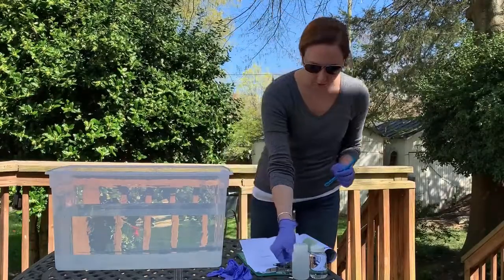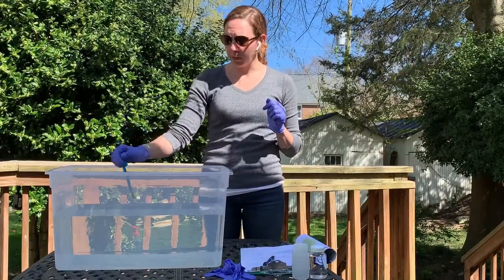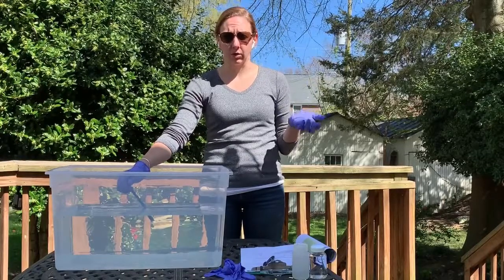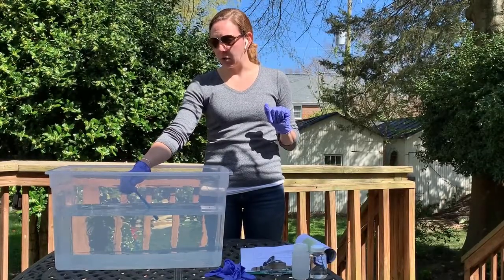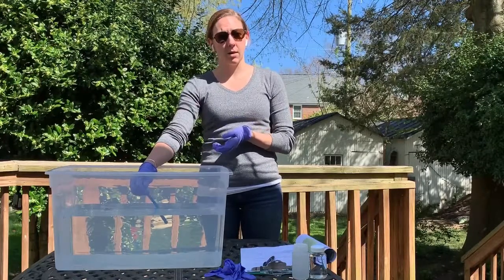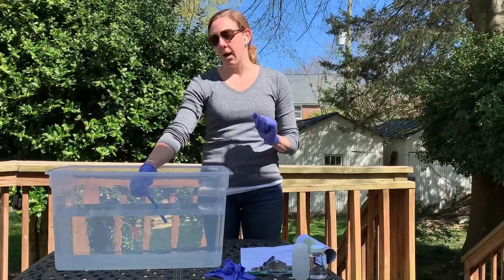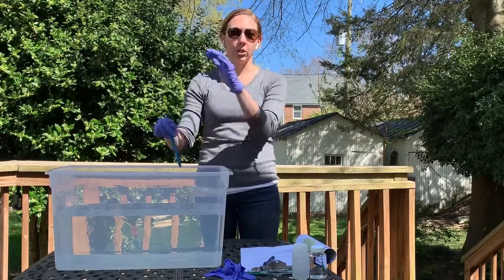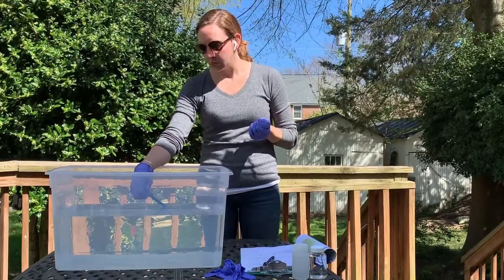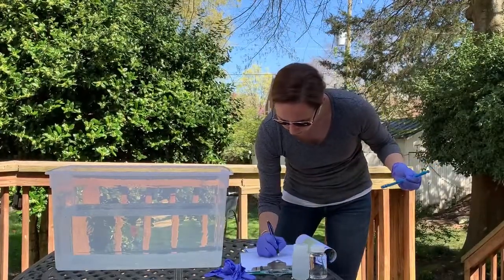Once you record your air temperature on your field data sheet, you can take your water temperature. Dip the thermometer into the water, again trying for a shadier spot or creating shade with your body. Wait for the thermometer to equilibrate. With these glass thermometers, take the reading while the thermometer is still in the water — don't remove it and then try to read it, because the temperature will start changing as soon as you remove it. Then record that water temperature on your field data sheet.